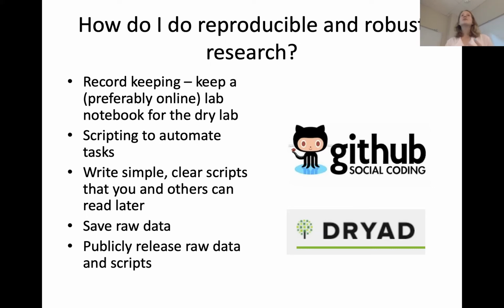I've had reviewers ask me that and say, well, it's great that you used STAR, but I need to know what version of STAR you used. I need to know every flag you used on the command line. Write simple, clear scripts. So if you are saving your commands and scripts, which we're going to start learning how to do today, write them as simply and clearly as you can.